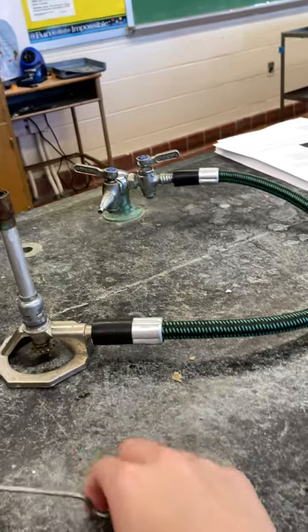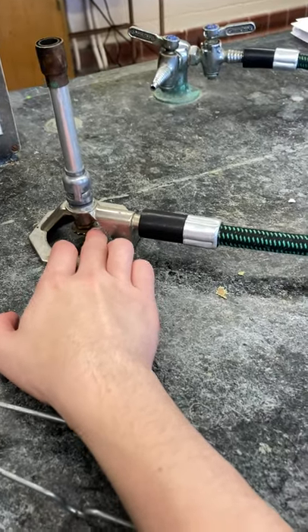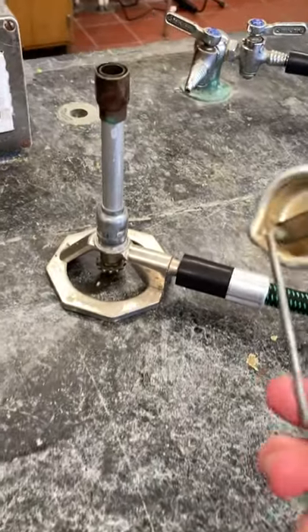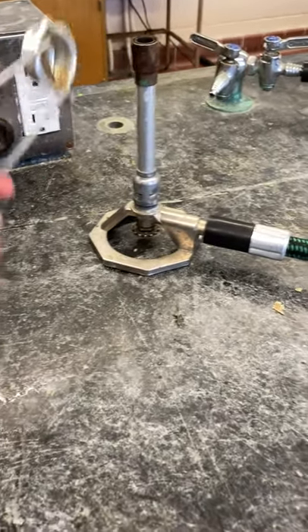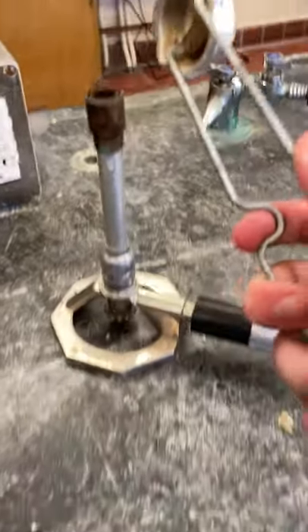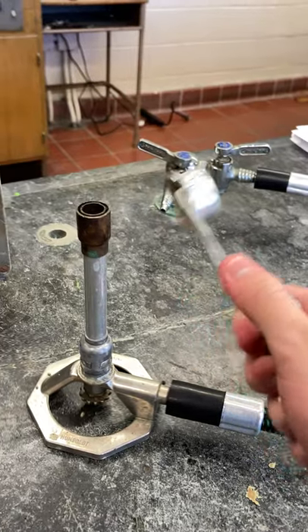No, the gas is fine. Gotta find out what that does. That closes it? Okay, so we gotta open it. Okay, I hear that. I think that's it. I don't know if this thing is working. Hold on. I saw that. No, the gas is fine. Stop talking about the gas. Turn off the gas all the way. No, you're trying to burn this. And then light it, and then turn down the gas. I ain't trying to put my hand down there. Once I turn this thing on, I'm leaving it.